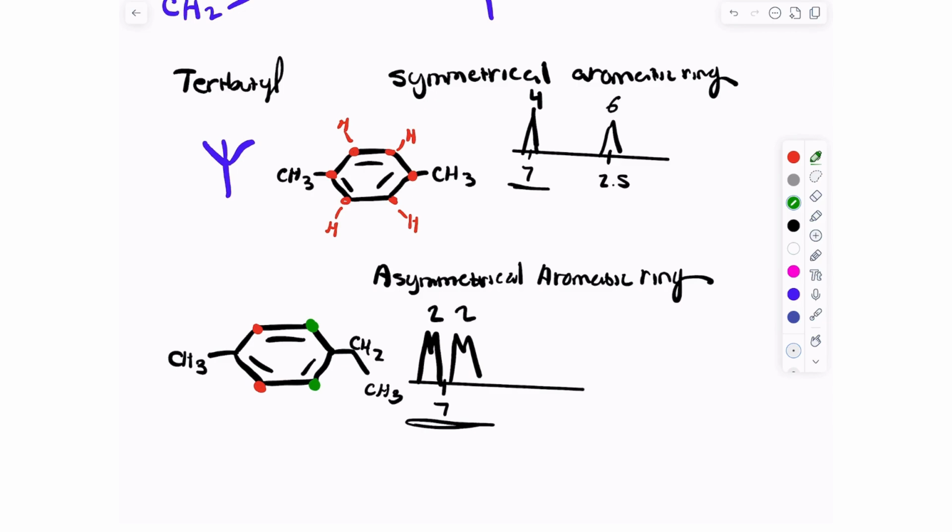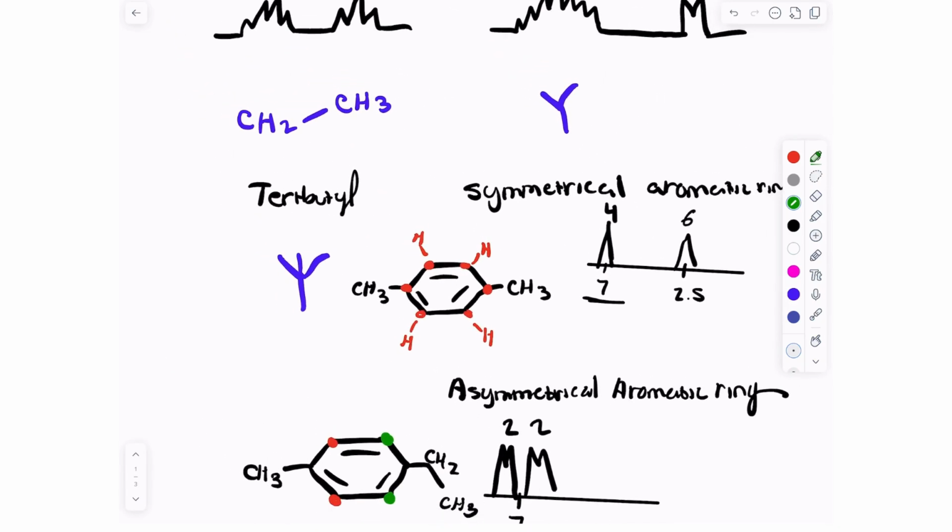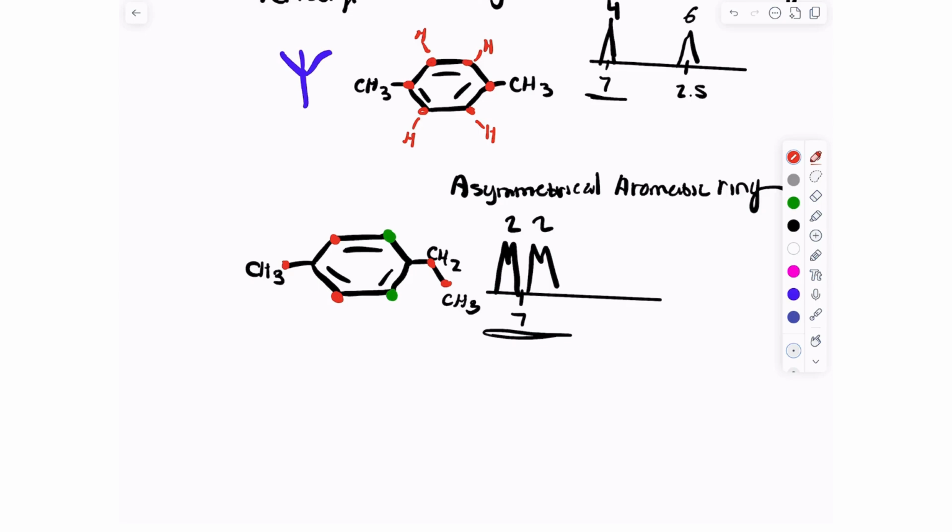Also, I just realized something about this problem up here. I think I said that these have a neighbor here. That's not true, actually, because it's a singlet. It has no neighbor. So, sorry for saying that. I actually mean these are all the same signals, so they would not have neighbors because, like I said, they're in the same family. You don't count your family as neighbors. So they actually have no neighbors because there's no proton here. That's why it ends up as a singlet like that. Sorry if I made you confused. I somehow forgot about my own saying, but it's okay.